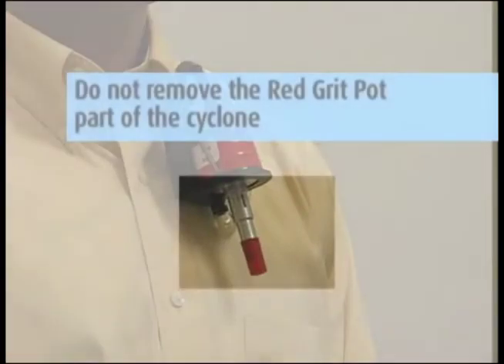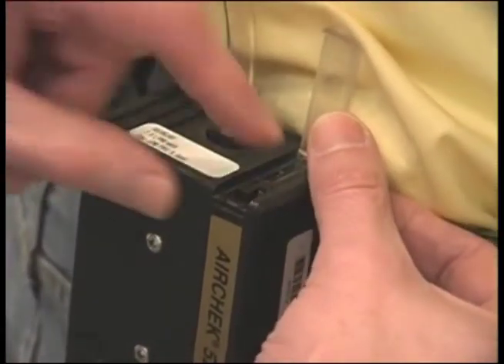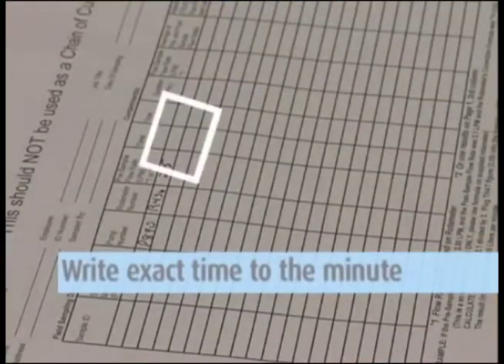Do not remove the red grit pot part of the cyclone. This will catch the larger particles that are separated during sampling. Turn on the pump and record the time to the minute that you started the pump.